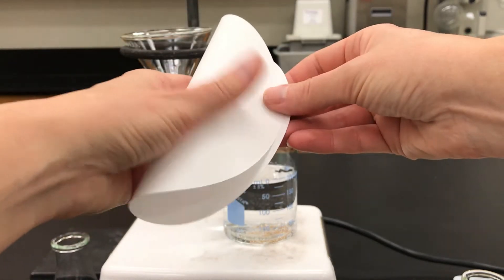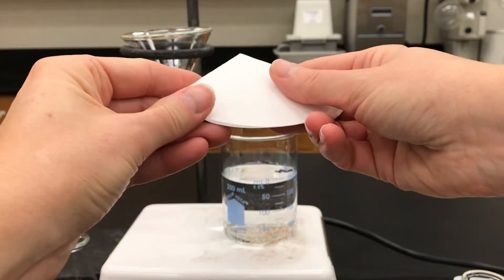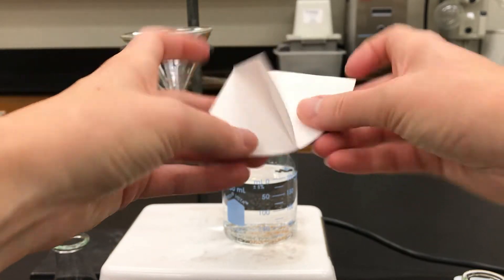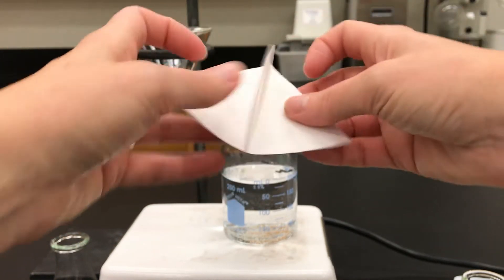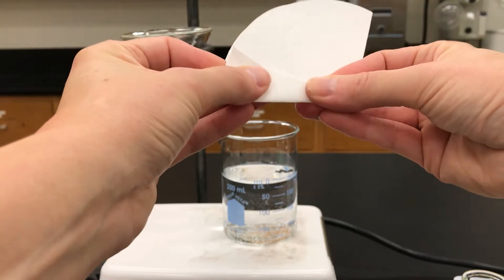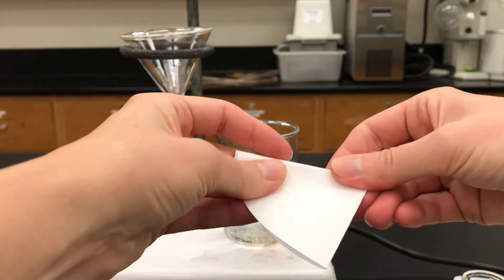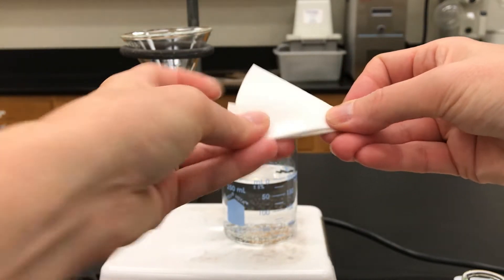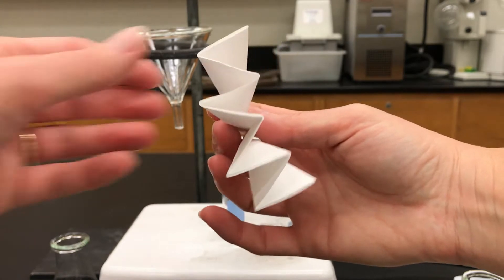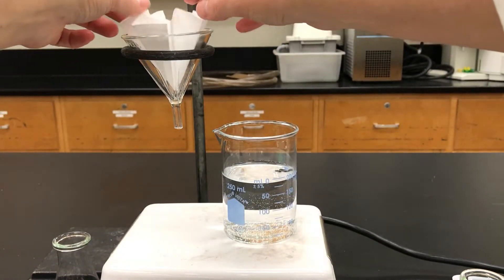Next you need a piece of filter paper to stick into the funnel. Although you could use a normal folded filter paper, if you're going to do hot filtration it's best to have as much surface area as possible, so I like to use a fluted filter paper. Fold the filter paper into eighths and then into sixteenths. I basically just used my folds from the eighths to guide me, but more or less I just want to alternate back and forth so that at the end I get something that looks like an accordion. You open it up and it has a lot of surface area, and then that just goes into the funnel waiting for later.